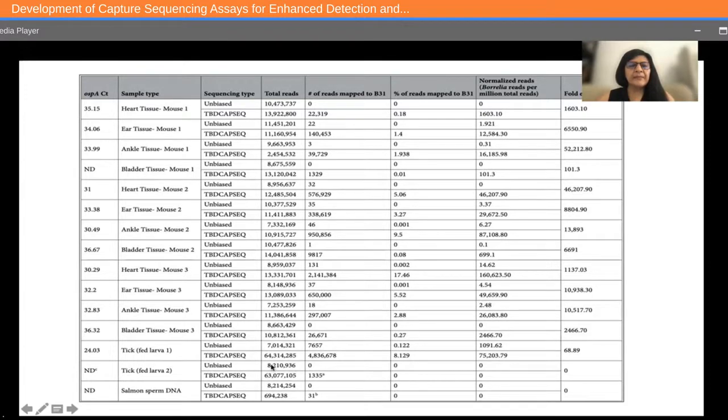So basically, this caused fewer reads to be assigned to other samples. And if we play around with sample preparation and library preparation protocols and cause this distribution to be more homogeneous, we can actually correct for this bias in the read distribution. And since the negative samples are correctly identified as negative, and positive samples are correctly identified as positive, both sensitivity and specificity of this assay are pretty good. These reads here are the ribosomal RNA reads that map to other bacteria.